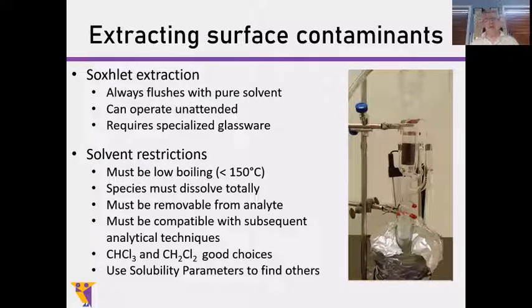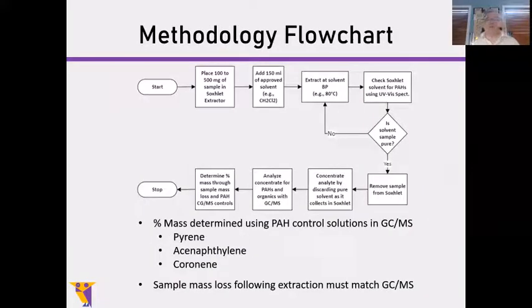And this leaves you with two, well, acceptable choices, and that would be chloroform and methylene chloride. Now, of course, these aren't necessarily first choices you might have in terms of them being relatively benign, but under the proper circumstances and with the proper supervision, they can be used safely. You can use something called Hansen's solubility parameters if you want to find others, but methylene chloride and chloroform are two good choices to get started.